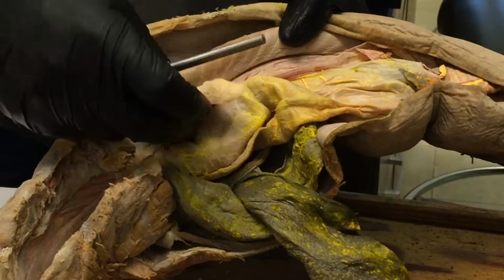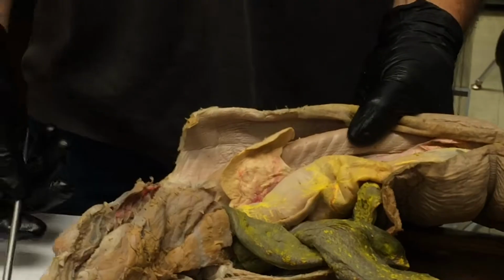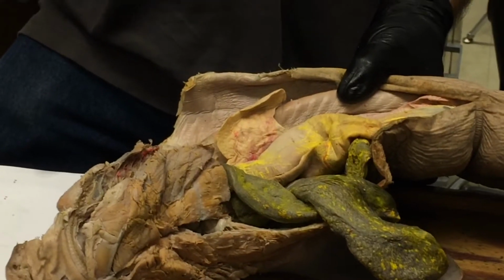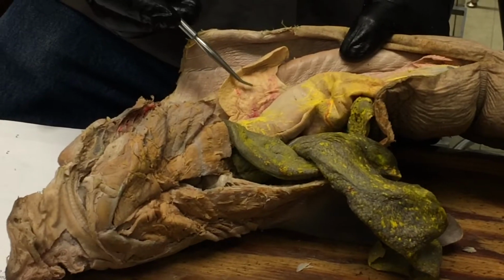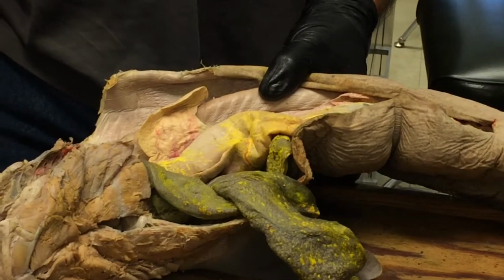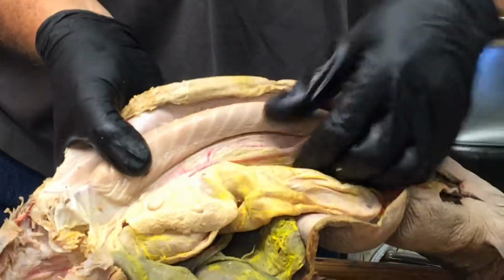Okay, the ovary is connected to the body wall by a mesentery, and that would be the mesovarium. Okay. Ovulation occurs. It's not really something you're going to see, but this is just a way to remind me to mention that ovulation is occurring by the egg actually popping through the wall of the ovary into the coelom, into the body cavity. Okay, and eventually then it is going to enter into the oviduct. And the oviduct you can see running along here. This is all oviduct.